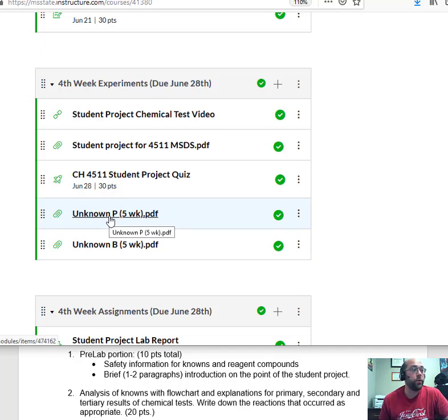All right, so what you're gonna do after you finish the quiz, you haven't really done anything yet except you've kind of went through the video. I think it's only like 5 minutes long, and you've went ahead and downloaded that MSDS, so that has all of the safety on every chemical possible. You're not going to list every chemical possible. You're going to keep the chemicals simple to what you would have used if you were in the lab.